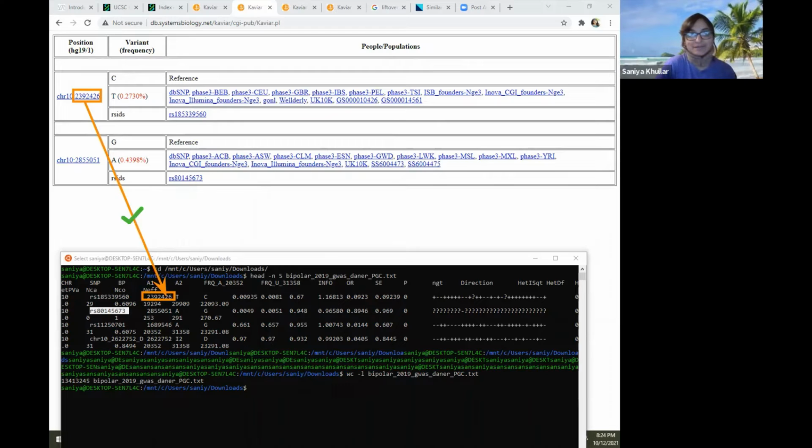And same in this other situation with this position. So we see that the SNPs are the same. And for HG19, HG38 even told us, hey, you probably are going to find that in HG19. So what you're going to see is that the same SNP can have different genomic coordinates. So one build is very different from another.